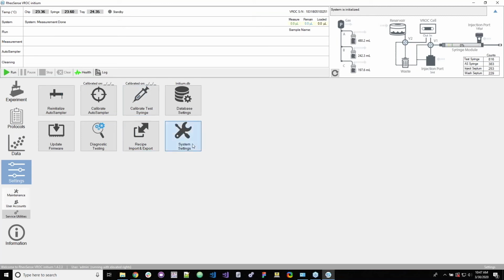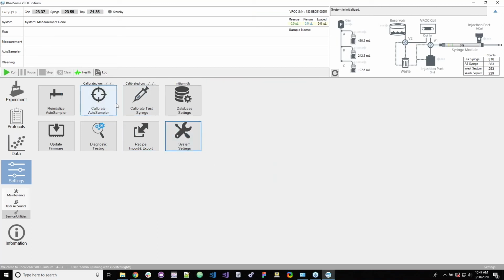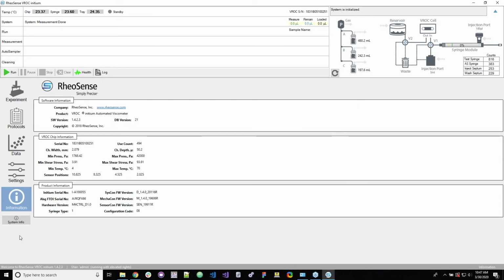So, and then you have your system settings here. I wouldn't really mess with this tab either. And finally, the information tab. So here we'll tell you the software information at the top. So the software version, and then here it'll tell you the chip information.